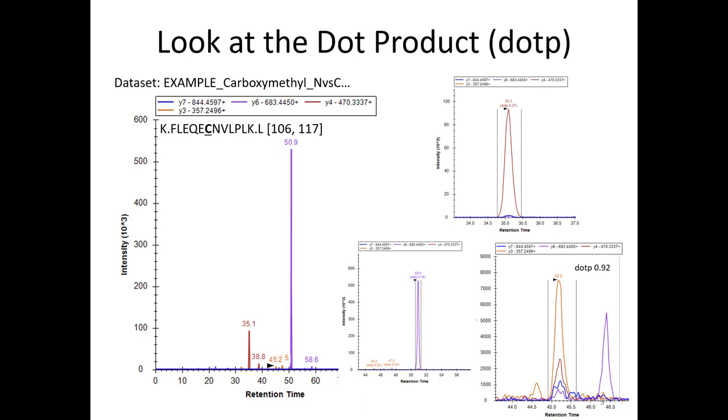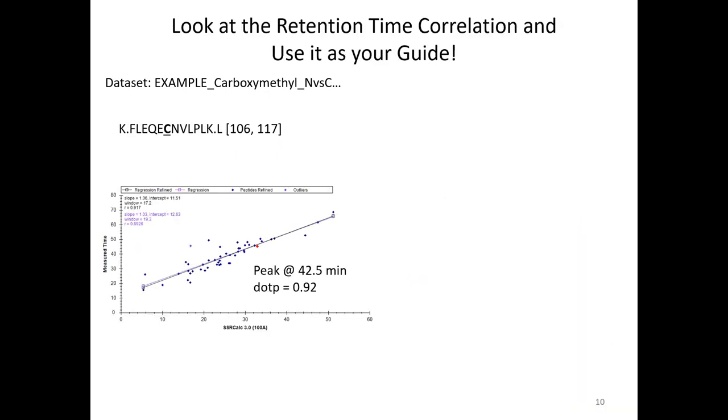I think my mind just tunes to something after all these years, where when I see no straight across line, I'm like, oh, that has to be it. That has to be it. This doesn't happen with everything, so you really need to go in and look at the data. In this case, Skyline did a fair job picking it.